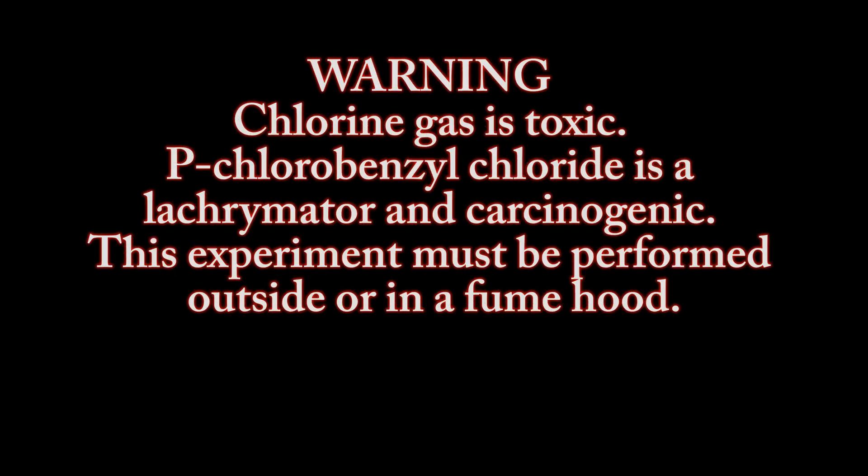Chlorine gas is toxic. P-chlorobenzyl chloride is a lachrymator and carcinogenic. This experiment must be performed outside or in a fume hood.